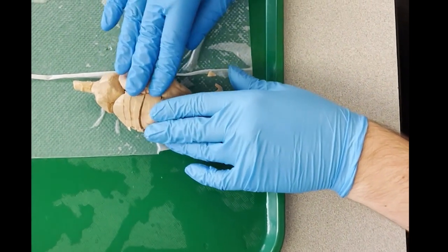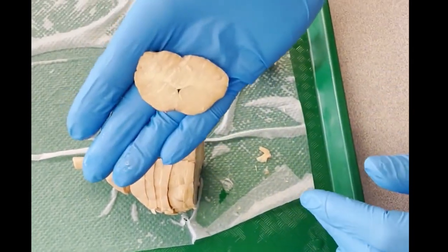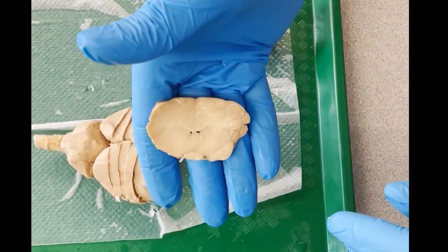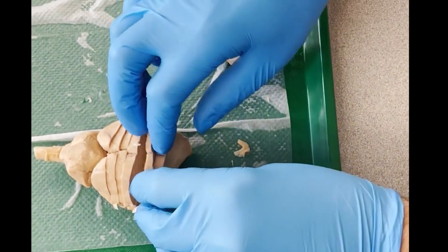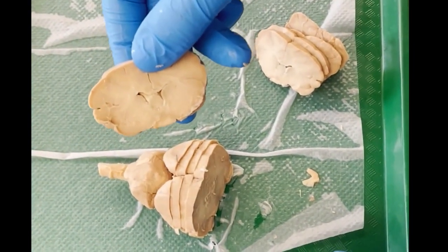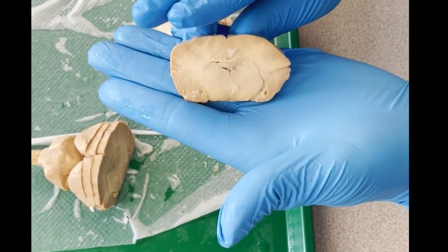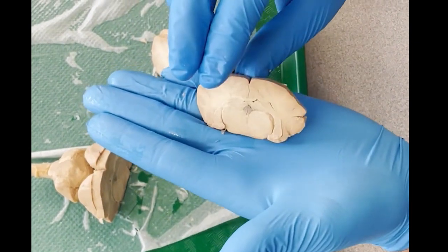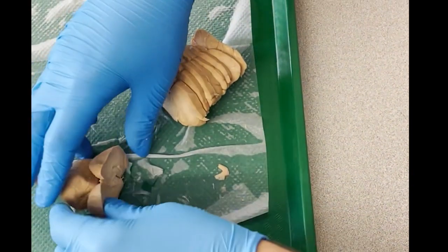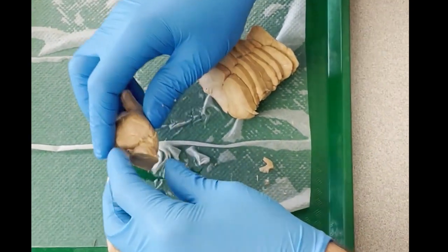Showcase this. I made cuts at these levels here, so we'll do this, and then this. This one's an incomplete cut. We've got this inner surface here. Other side. Ours is giving very yellowy, where this is, like, cool. And let's take that off to expose this brainstem area.